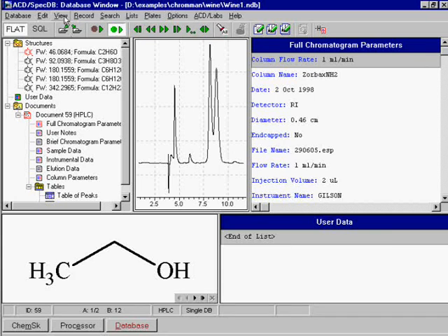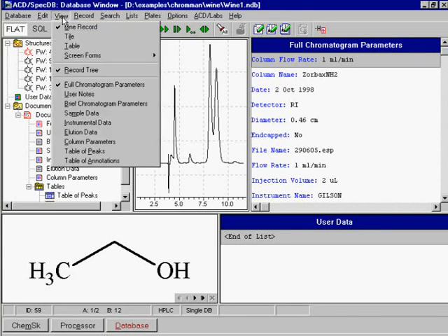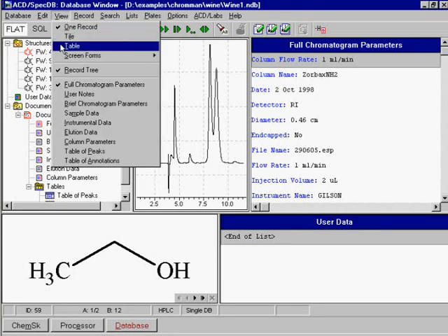We switch to the table mode to view the found hits on one page. It turns out that the retrieved samples contain different amounts of sucrose, the presence of which is the main criterion of wine's authenticity.